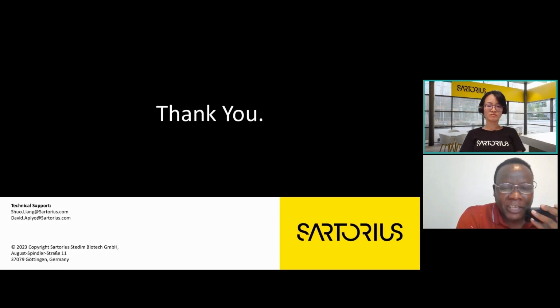So initially the primary antibody is bound, and then the secondary antibodies are screened to see which ones bind to a different epitope. The second format would be the classical sandwich assay format, which is very well known by most folks within this environment. In this format, the antibody is first immobilized or captured onto the biosensor surface, followed by the antigen binding, and finally the screening of the different secondary antibodies that are being characterized.